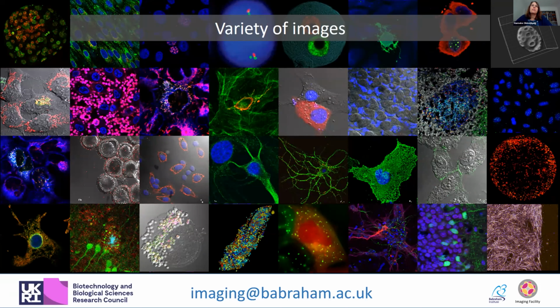within our imaging facility, I get a huge variety of images.